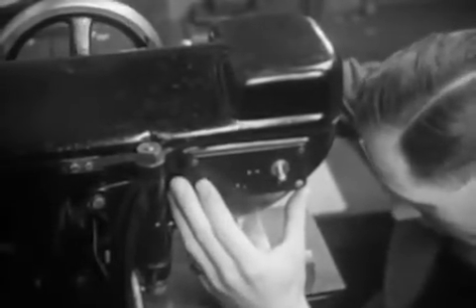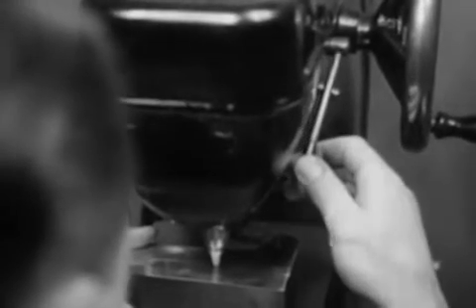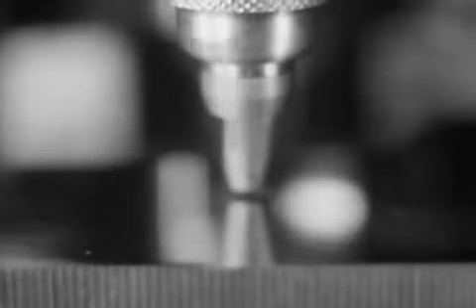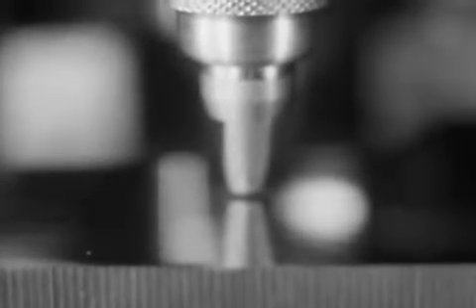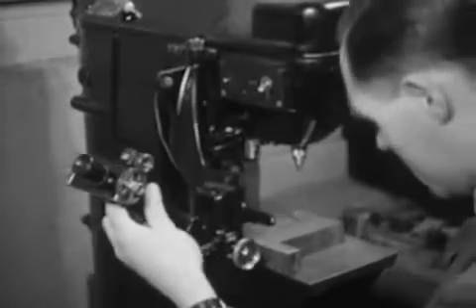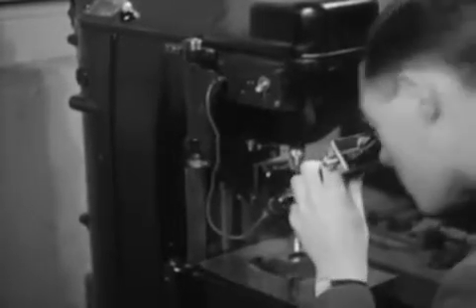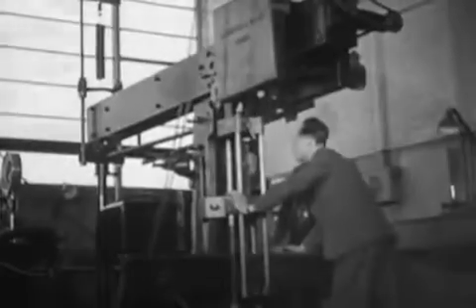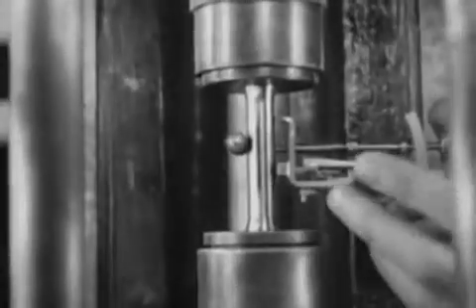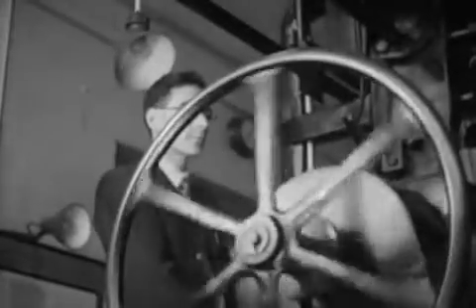Another sample of the tire is tested for hardness. A hard steel ball applied at a known pressure for a known time makes an indentation in the surface of the steel, which is measured under a microscope. In the Buckton machine, the breaking strength of the tire steel is tested. The sample is subjected to a vertical load, which is measured by the beam balance.